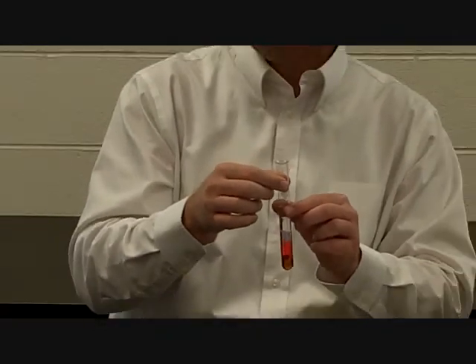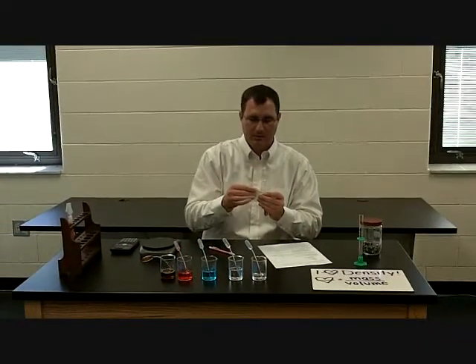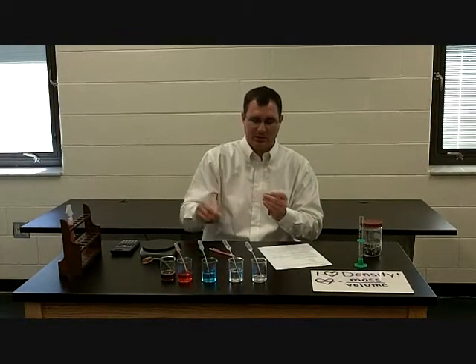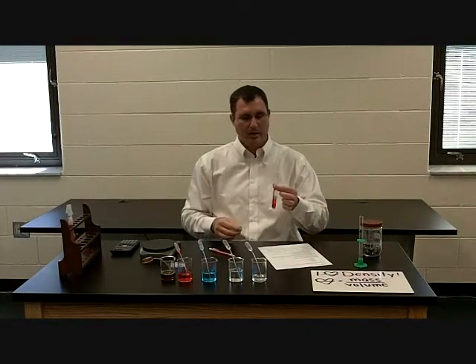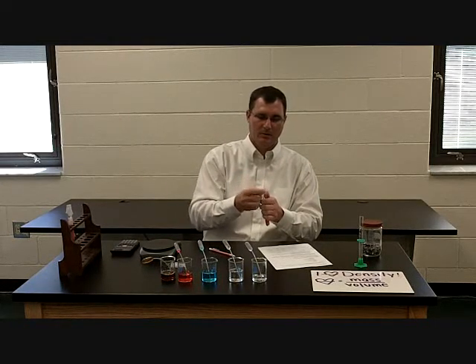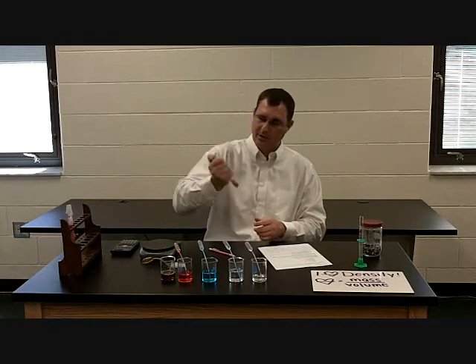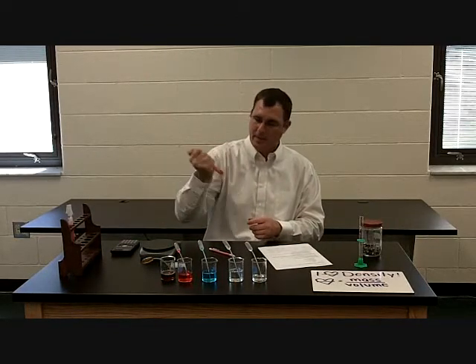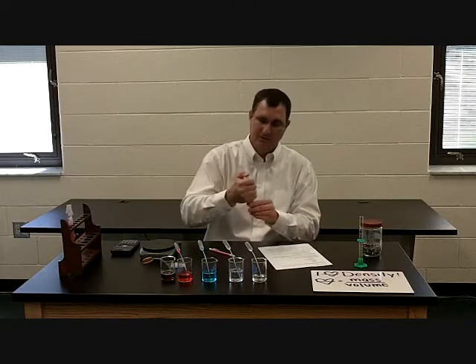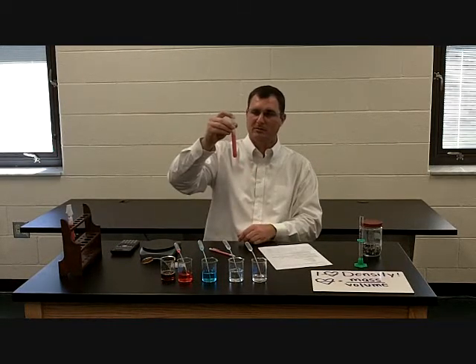The last thing we're going to do in this lab is we're going to take some paraffin film, okay? And it's this neat, stretchy kind of wax paper. And we're going to take the paraffin film and we're going to cover your test tube. Good. And then we're going to shake it. Oh, we had those pretty layers, and now we're going to mess it all up. There we go. And when I first do it, I get this pink mush.